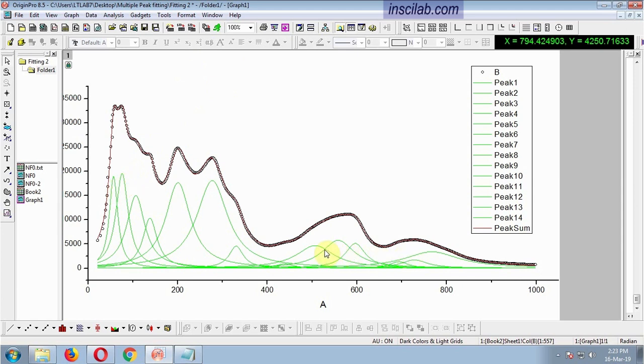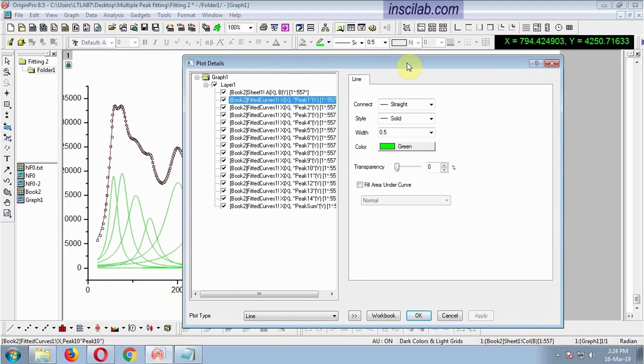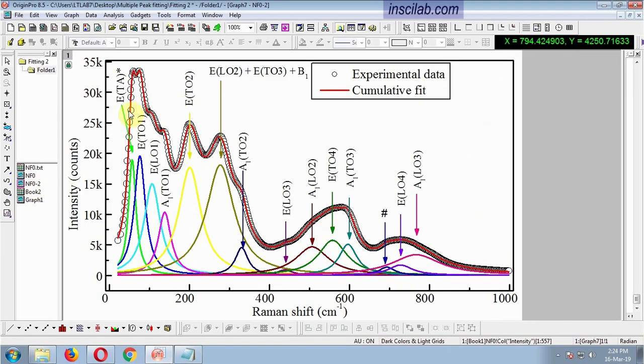Now I will show some useful functions for very new learners. Double-click to customize the individual peaks. Change the colors and width so that you can make it like this. Find out a theoretical or computational published work on your material, or at least a material with similar structure. Compare the peak positions with those reported computational values. Then you can index the peaks like this.